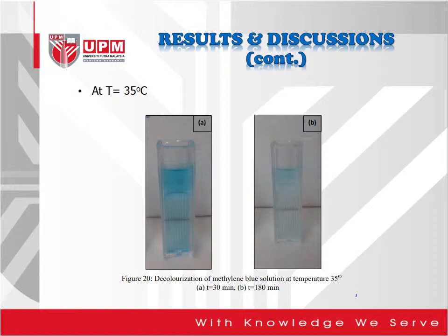This does not show much difference between the temperature of 30 degrees Celsius and 35 degrees Celsius because the degradation efficiency is almost the same. However, we still choose 30 degrees Celsius as the best temperature considering the energy efficiency and to lower the cost.